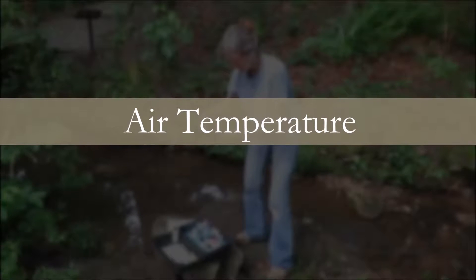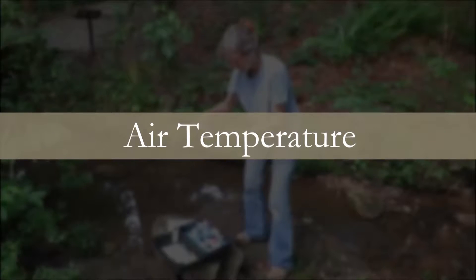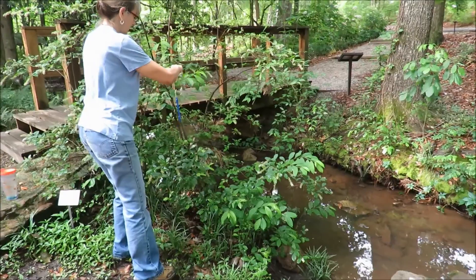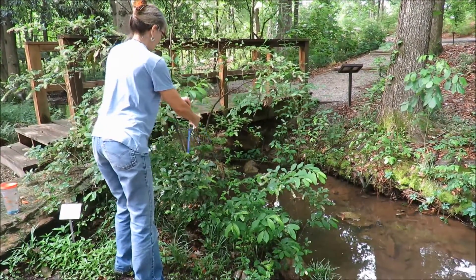We will start with air temperature. Always take air temperature before water temperature for the most accurate readings. Upon arrival at the site, place the dry thermometer in the shade until the temperature stabilizes. This will usually take two to three minutes.